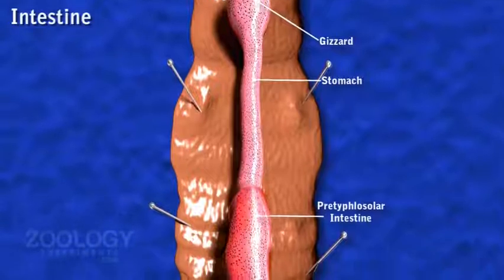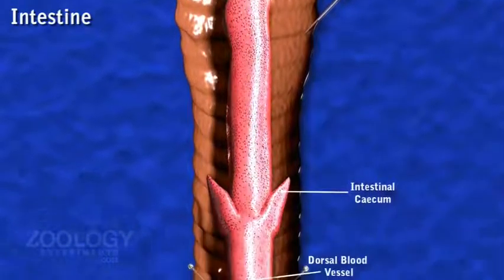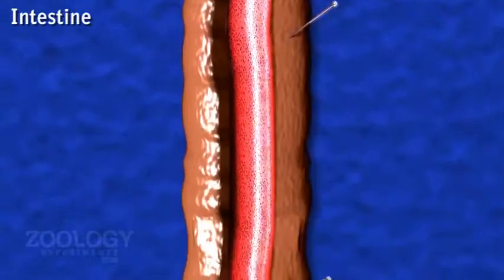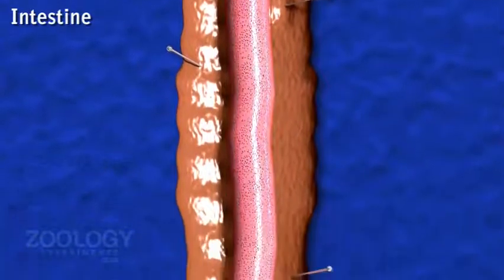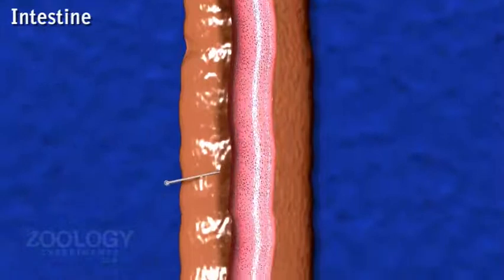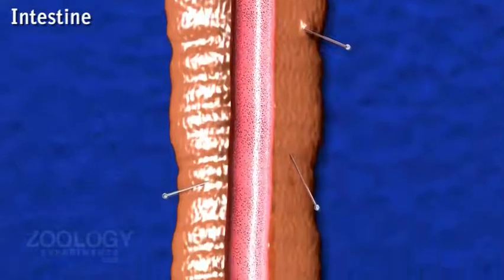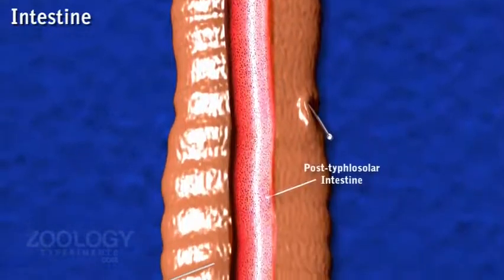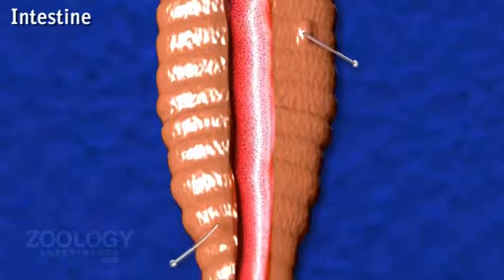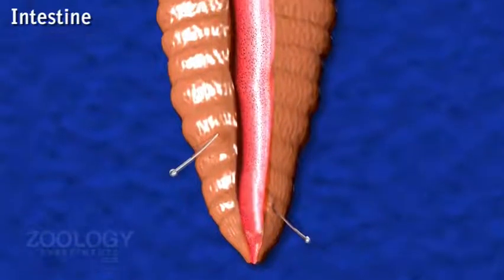The intestine is next to the stomach, which is a long, wide and thin-walled tube extending from the 15th segment to the last. It has a beaded appearance due to circular constrictions corresponding to septa. Its internal lining is ciliated, folded, vascular and glandular.